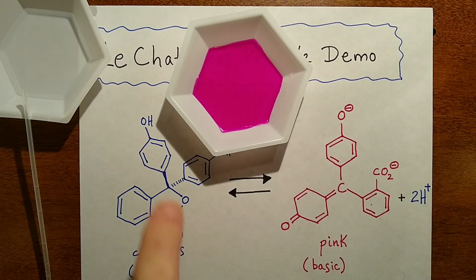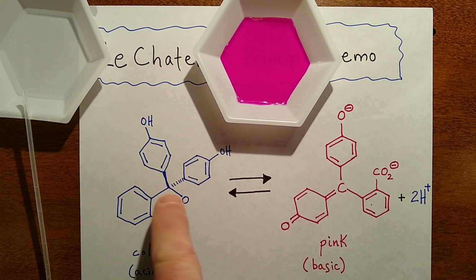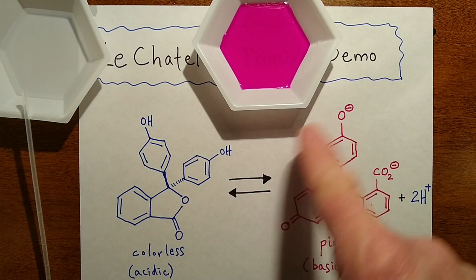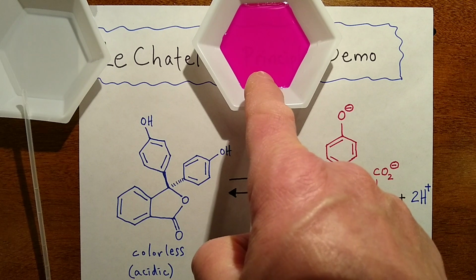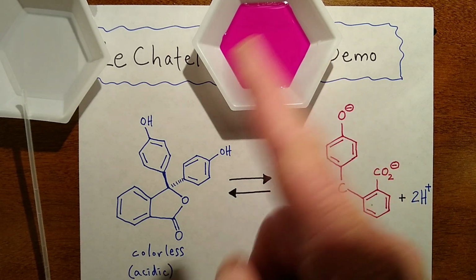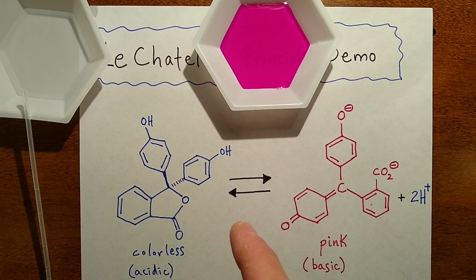Why did it turn pink? Because I added a lot of hydroxide ions. Those hydroxide ions will react with the two protons. This colorless form is in equilibrium with its basic form, the pink form. And when that happens, it releases two protons to become this structure. This structure absorbs visible light and turns colored pink. This molecule is absorbing some of the white light from my lamp, subtracting out some of the colors of the white light, so it becomes colored. You might have learned about that in grade school when you were talking about complementary colors.